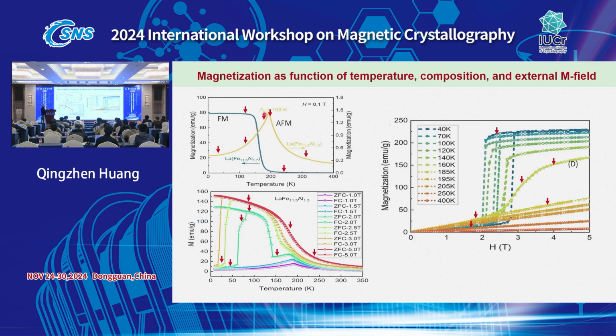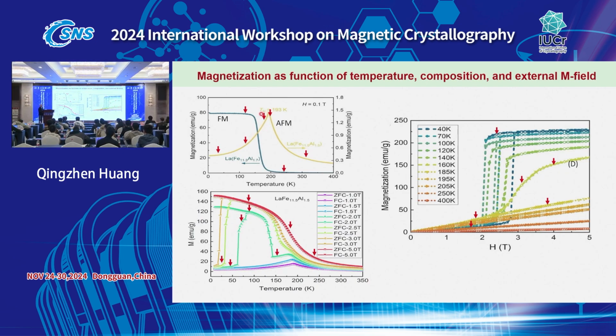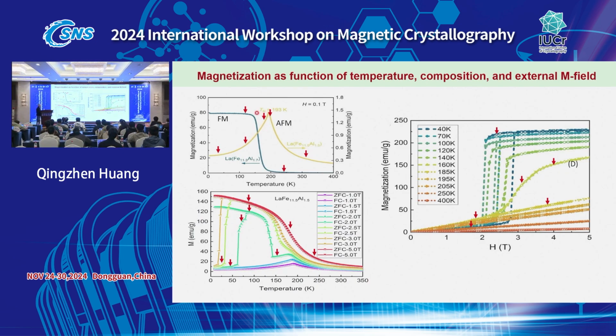And on this transition, why do I need to have one in the middle of them? Because the transition is not this short. It's not quickly going down. We know the magnetic measurement measures the ferromagnetic signal. So if the antiferromagnetic transition is here, then the ferromagnetic signal should be gone.